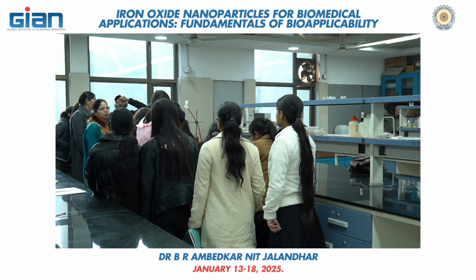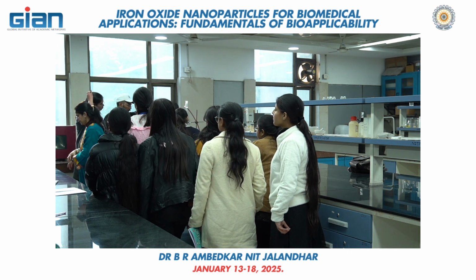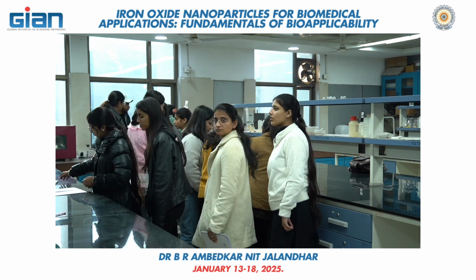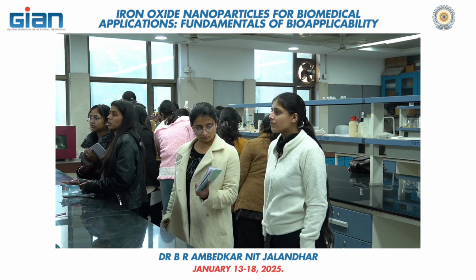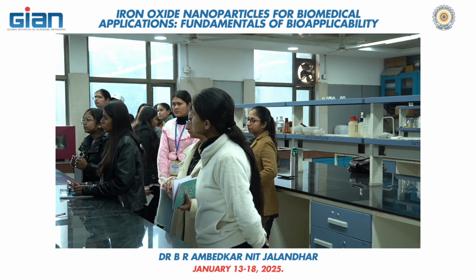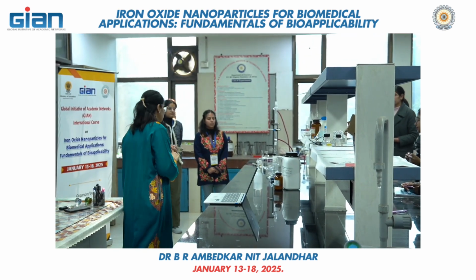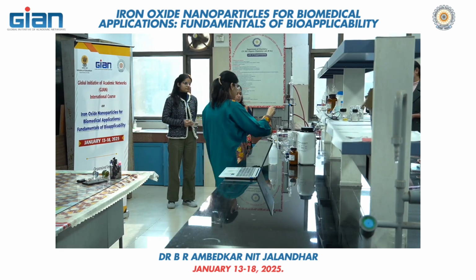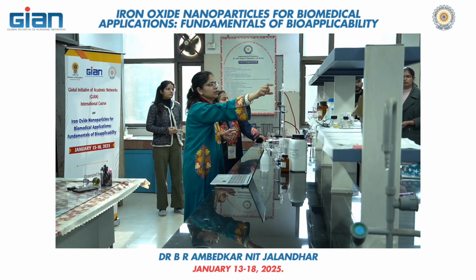So how many groups or everyone has completed? Yes. So now I am winding up. So all the groups have completely synthesized the silver and the gold nanoparticles. Yes. Everybody. So we have two different samples, one of the silver and other of the gold. Can you show me the samples?